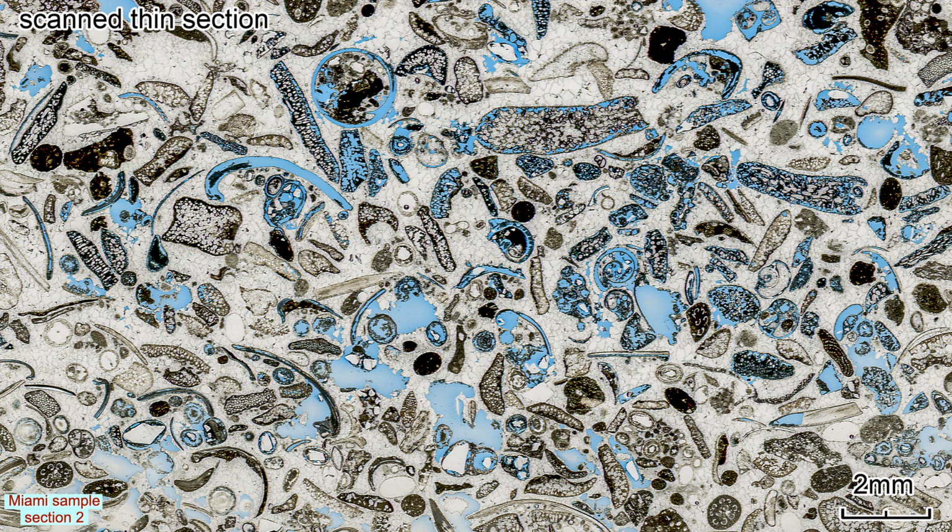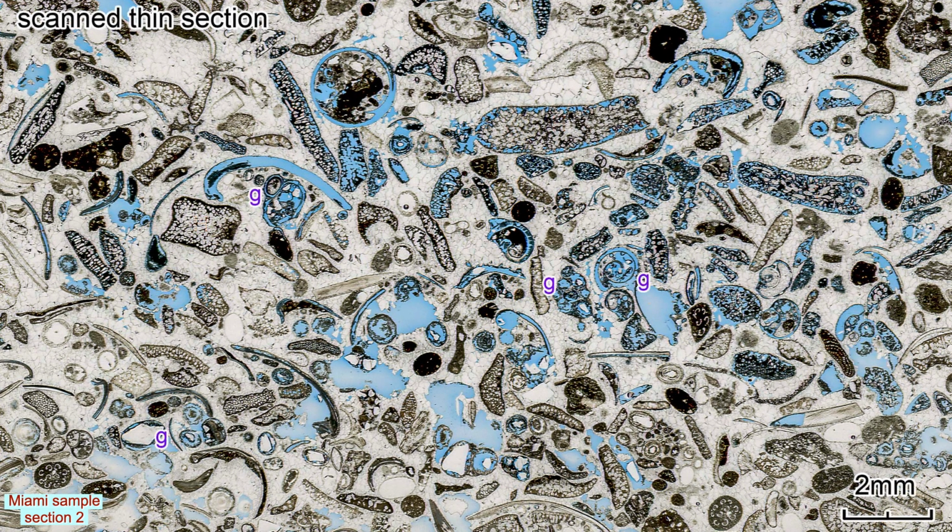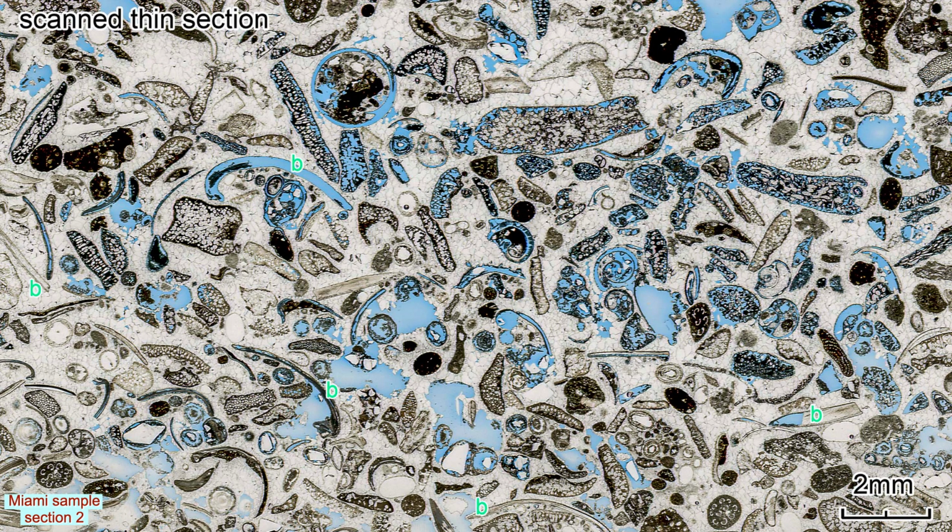The second Coral Gables waterway thin section is of a skeletal ooid grainstone that contains, in addition to ooids, halimeda fragments, gastropods, bivalves, and the decapod pellet Favrina. The intergranular pores are patchily filled with calcite cement. The ooids show a similar range of preservation types as noted for the first Miami section.